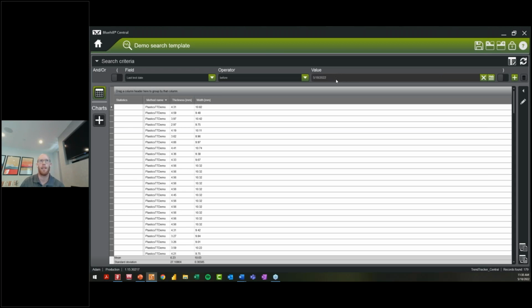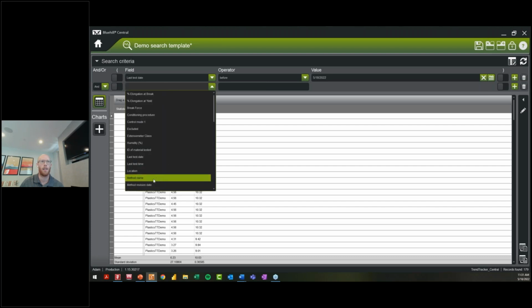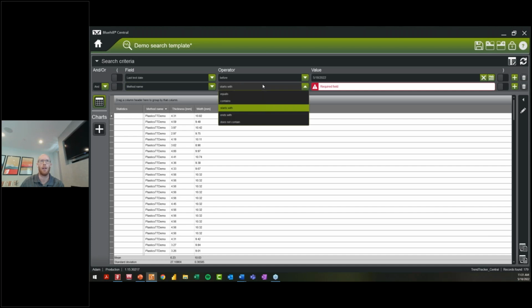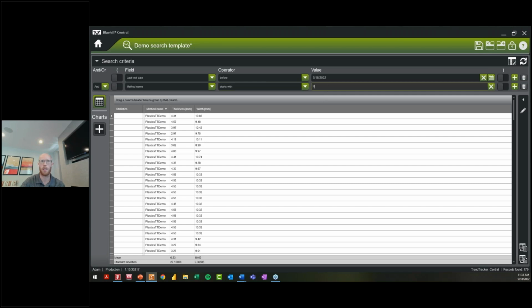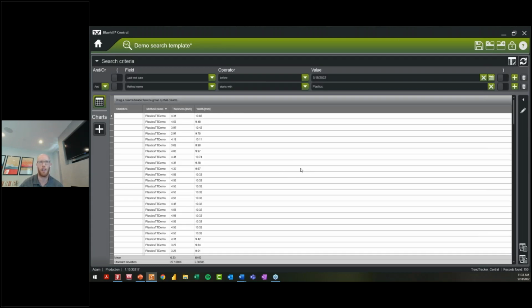And so for this demo, I'm going to say that I want to add another criteria, and you can add as many as you want, but I'll add a second one, and that is going to be everything associated to a particular method. So I'll say that if I really want to look at this plastics demo, I'm going to say that anything with a method that has plastics as its starting is what I want to look at today. And so it was 179. So again, probably a very fresh data set, only 179, but I just added the second criteria, and now I'm down to 150 results. And this is a good data set that I've set up for demoing purposes.